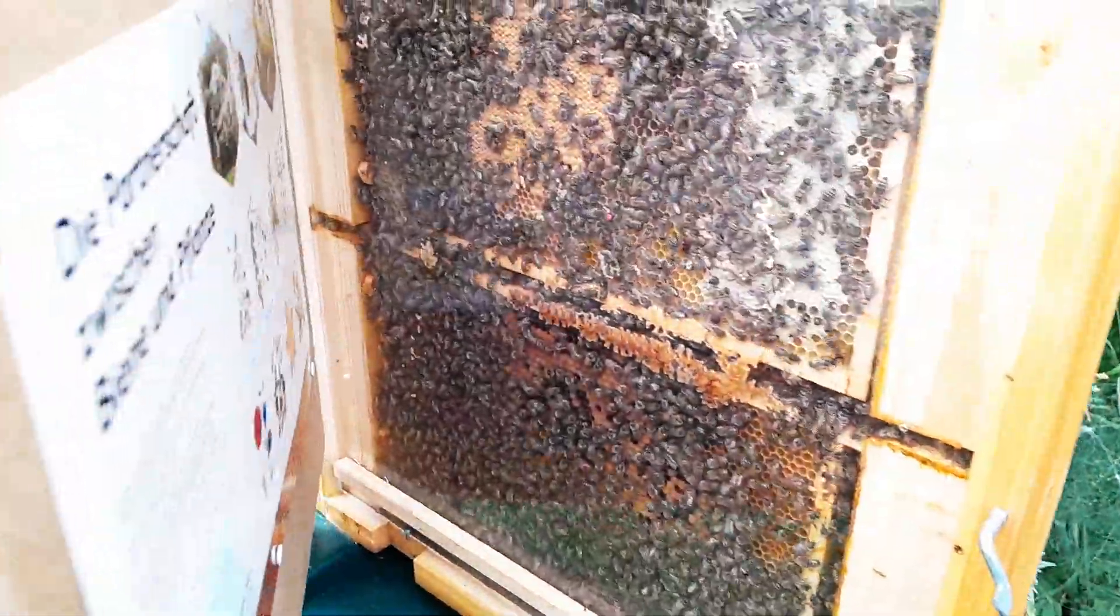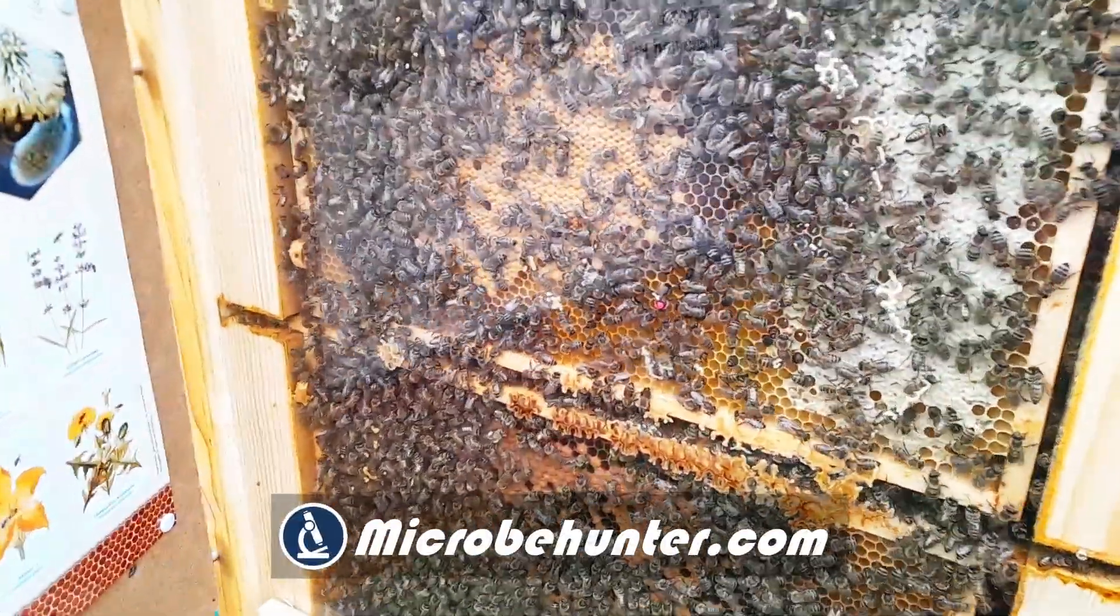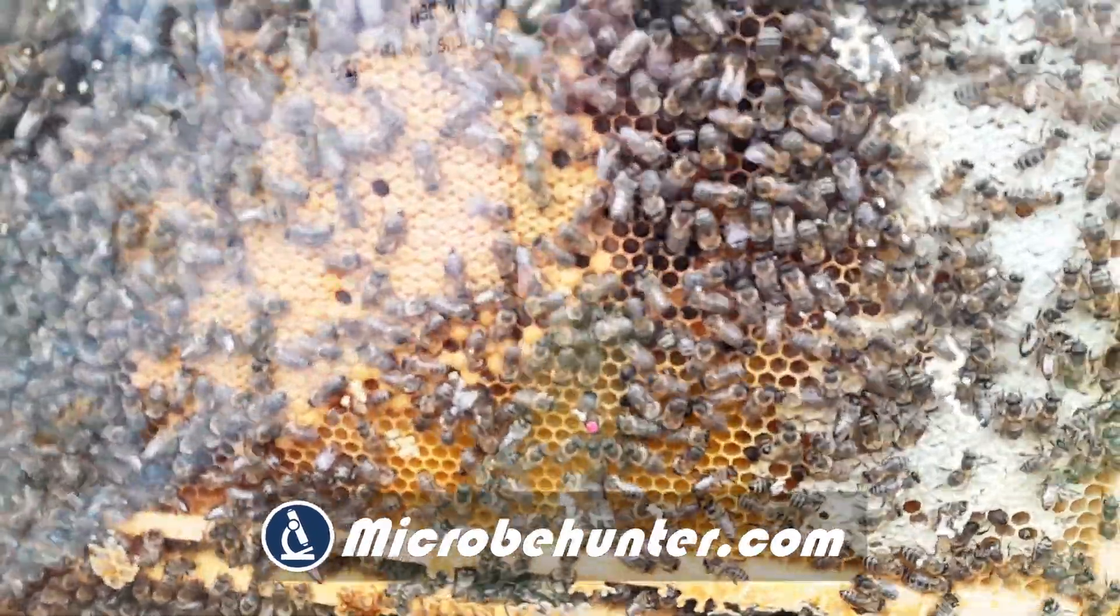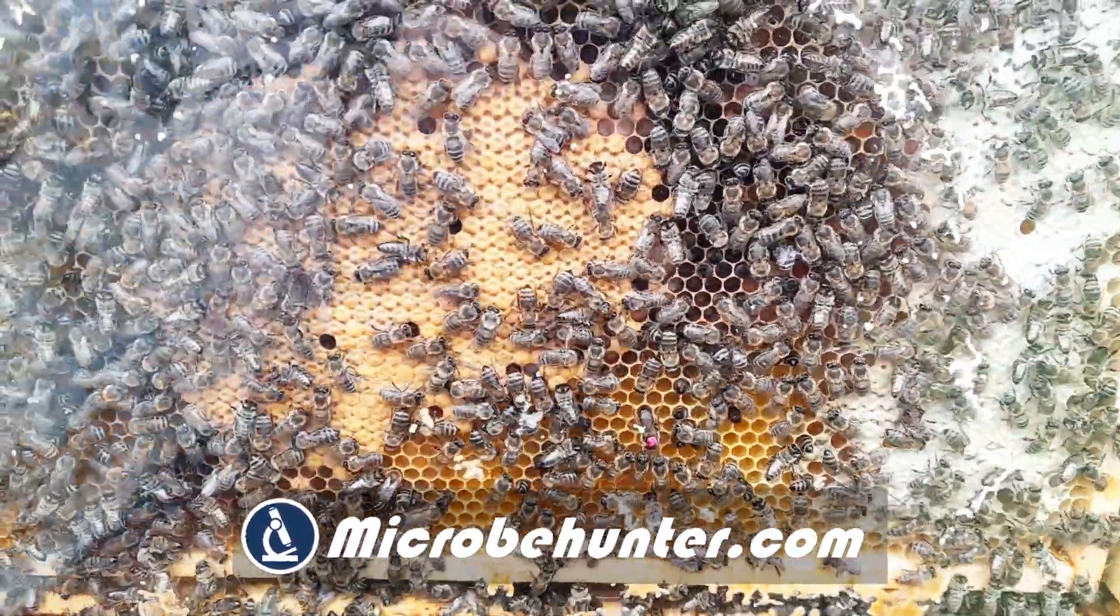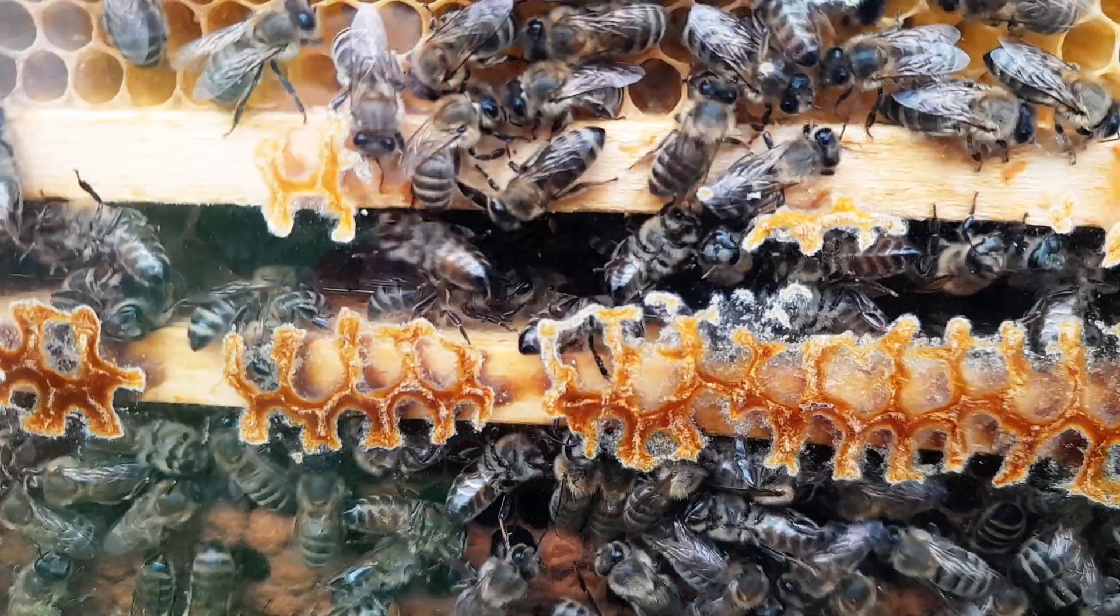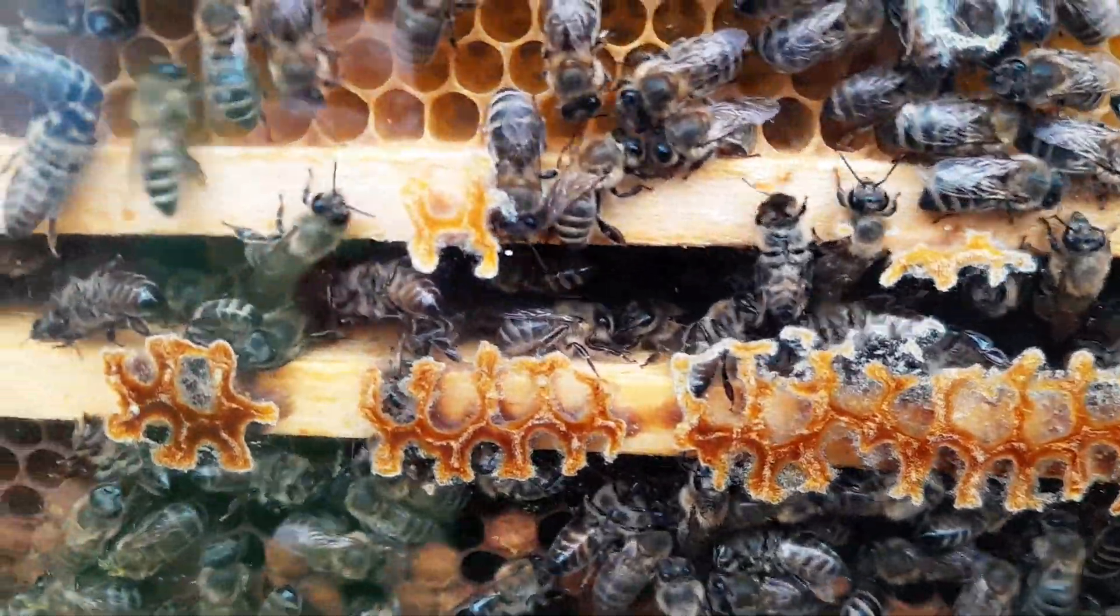Today I would like to explore why bees are able to sting you only once and wasps are able to sting you multiple times. With the help of a microscope, I'm able to answer this question.